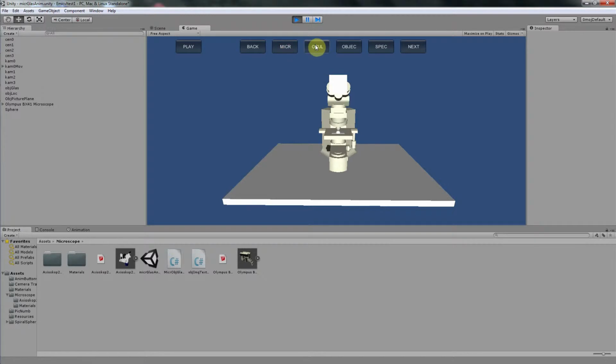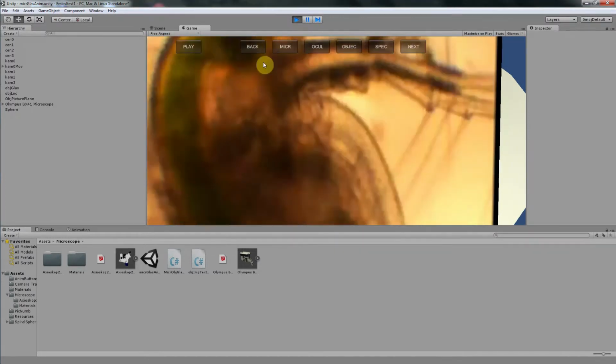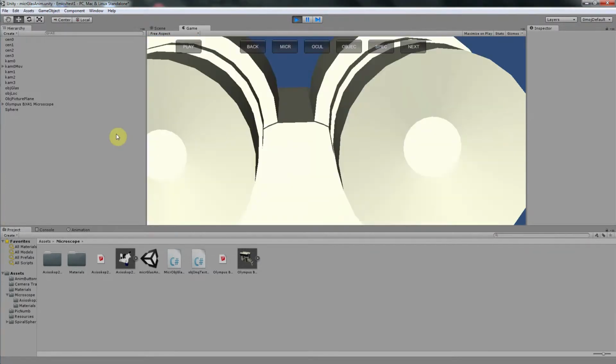This is the objective glass which goes under the microscope, and above we see a Daphnia moving. If we can bring it nearer with another viewpoint so that we see the image also nearer. We can go back, back.